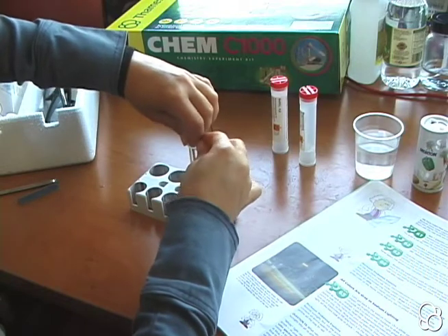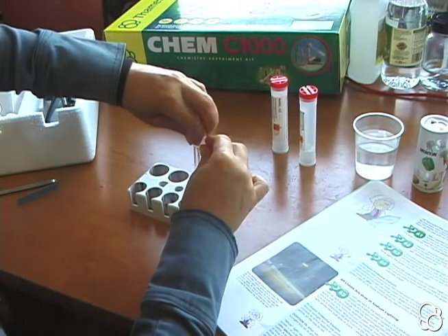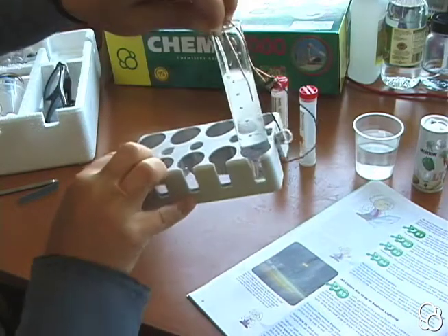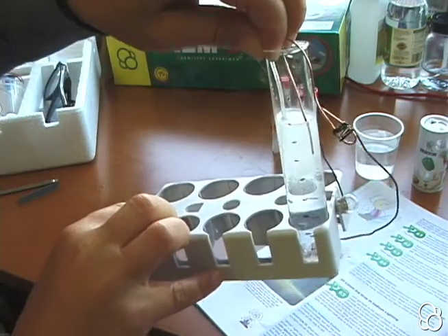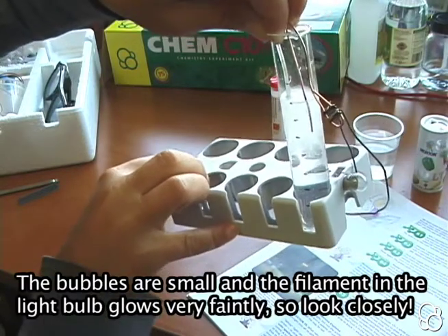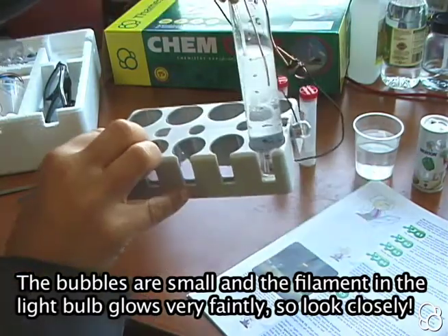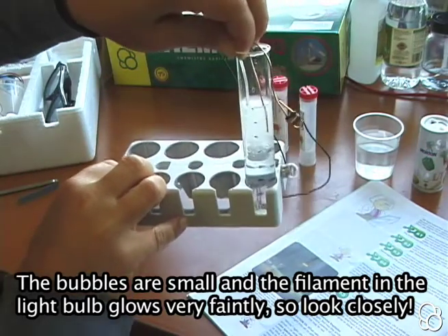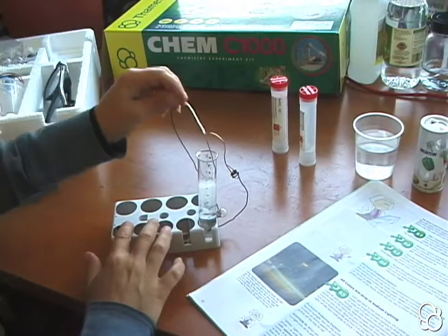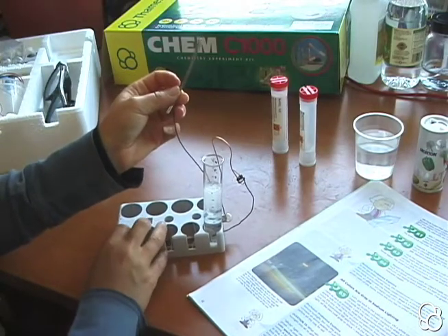You should see a very faint light coming from the light bulb. You'll also notice gas being produced inside the test tube, these white cloudy bubbles. When you take the magnesium strip out, you'll notice that it's been eaten away—it's dissolving the magnesium.